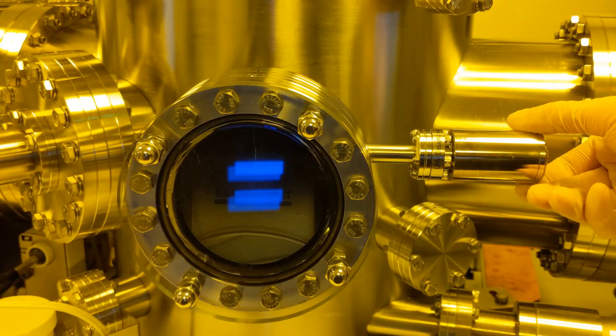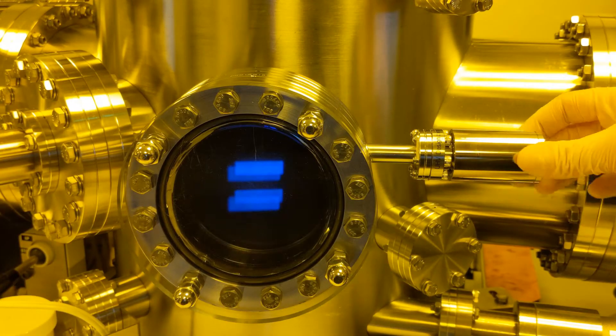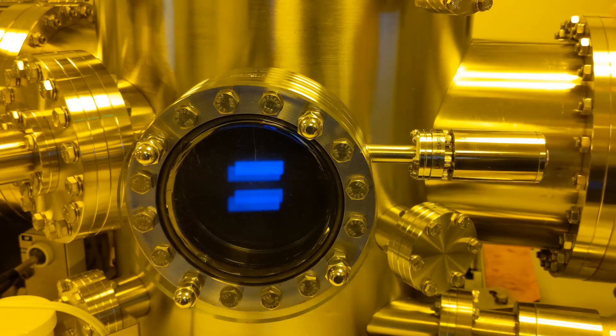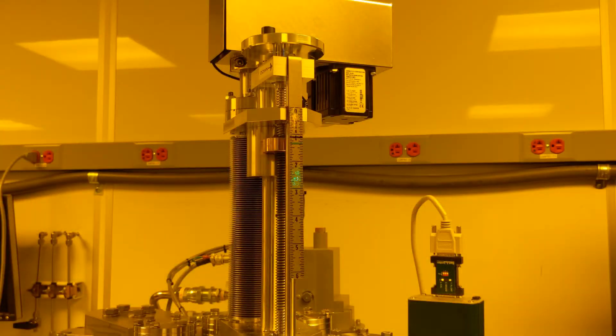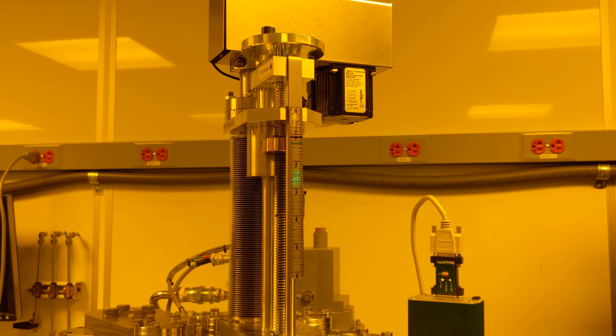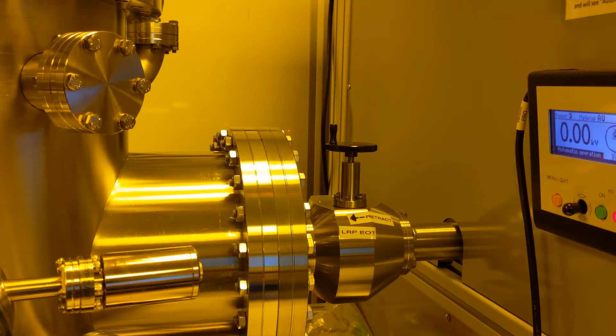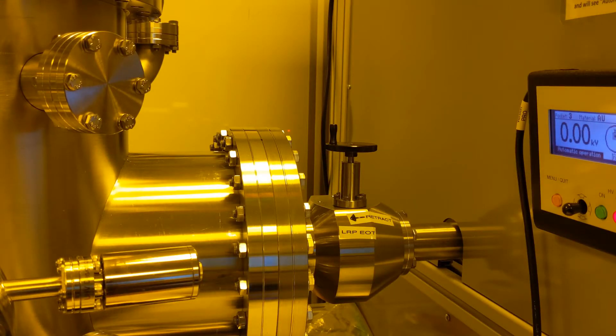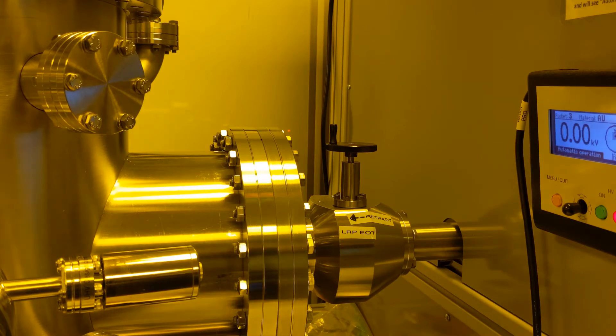Open the front viewport so you can see inside. Now check that the main chamber substrate manipulator is raised all the way up. At this point you should home the main chamber stage and open the transfer valve.